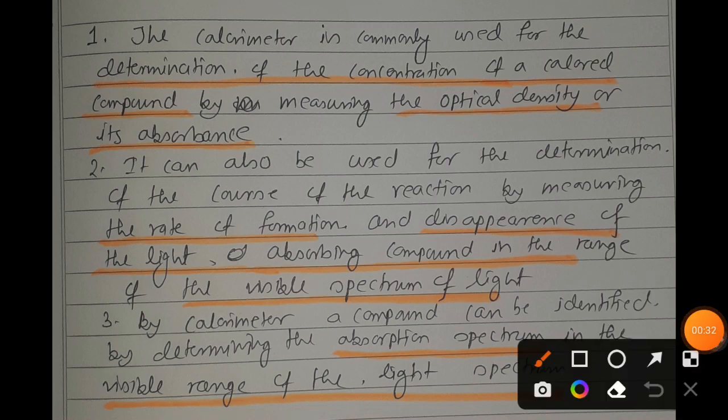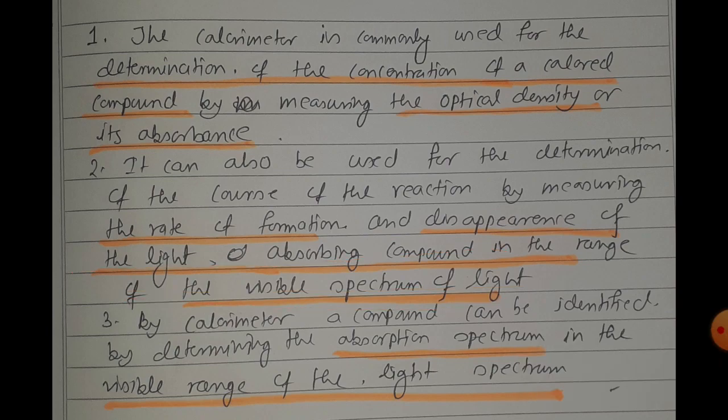Okay, the second one is it has the ability to determine the course of the reaction, by determining the rate of formation or disappearance of the light absorbing compound in the range of the visible spectrum of the light.